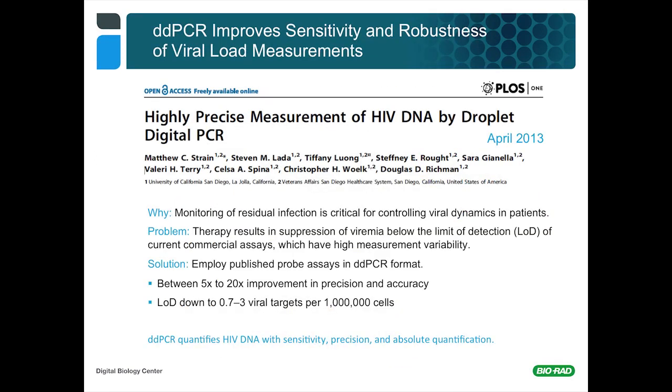So one very powerful realm in which this has been deployed recently is in the HIV detection community. And investigators that have been working at trying to eradicate HIV recognize that we have very effective antiretroviral therapies that can knock down the viral load to perhaps undetectable levels, but there are still reservoirs of latent virus, provirus, that's integrated into the human chromosomal DNA, and this DNA is a source potentially of a reemergence of the infection.